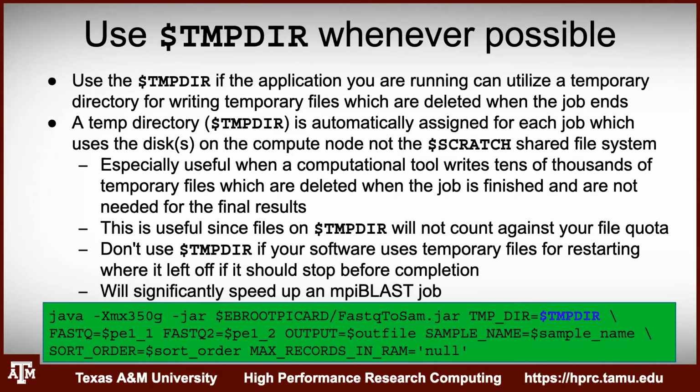There are some things you need to watch out for though. If you're using some programs, you can run, and if an error pops up, you can address the error and then start the program from where it left off. If it requires those temporary files to restart from where it cut off, then you shouldn't use TMPDIR because those will be deleted after the error.